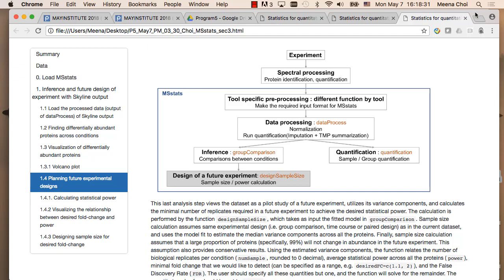That is one of the things, the quantification. Quantification means, with the run-summarized data, if you have technical replicates and you want subject-level or group-level summarization, you can use this quantification. With this, you can do some classification analysis, like what Olga mentioned this morning, biomarker study, or some logistic model or PCA or something else.